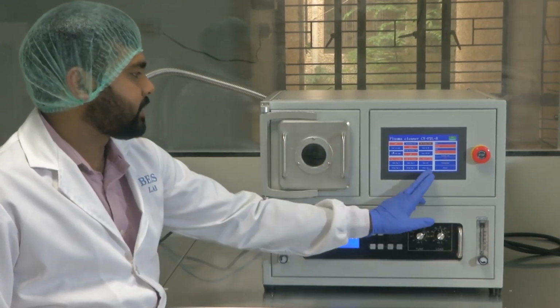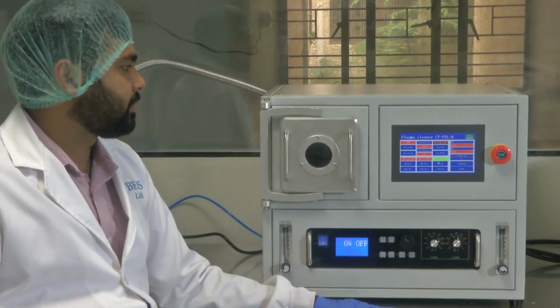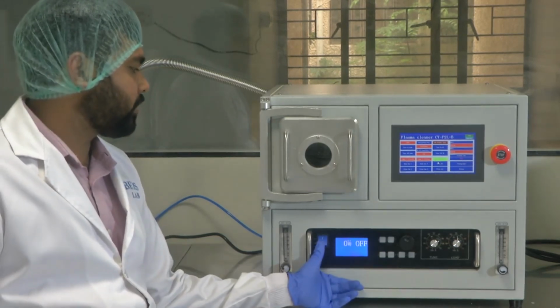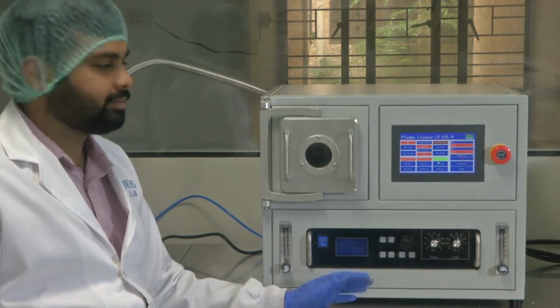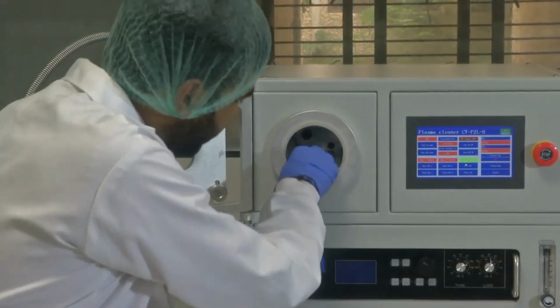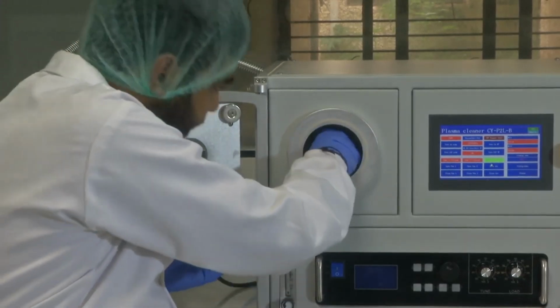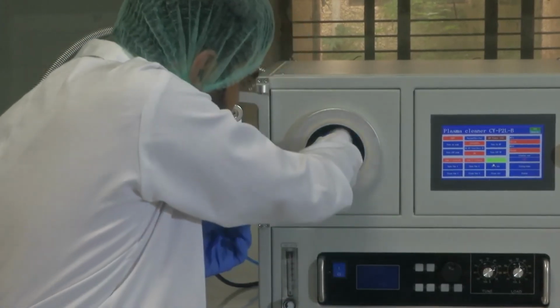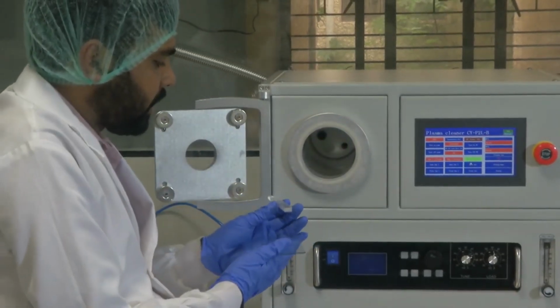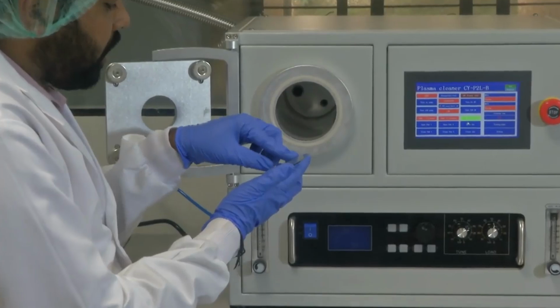Now I will vent it. So I have vented it, everything done. I can even switch off the system now. I have switched off the system. Now we will open the chamber, take out the samples carefully. I have taken it out, and I will try to keep the surfaces that have been plasma treated on top of each other.